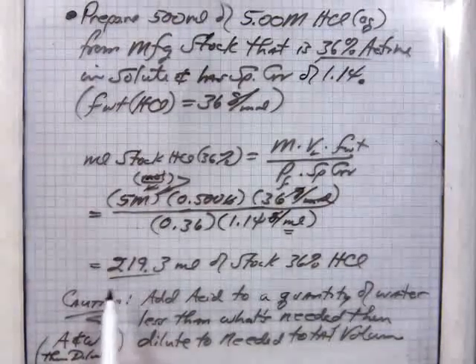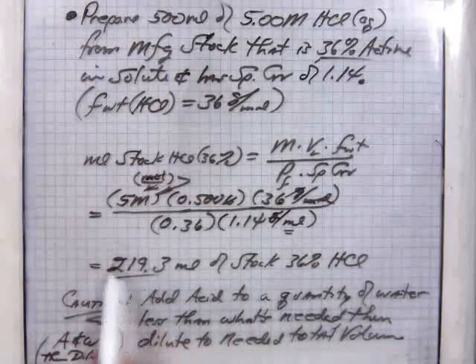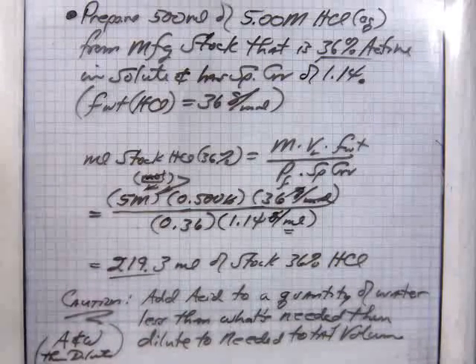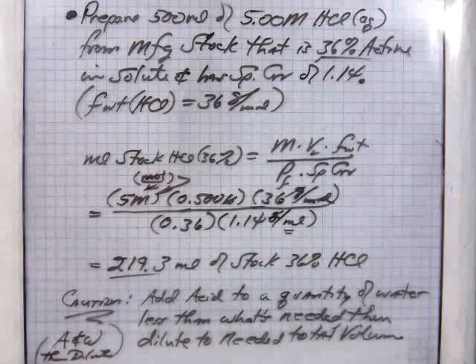Now, if you overshoot the amount when you make it, just go to the dilution equation and cut it back to what's needed. However, working with solutions affords many times more accuracy than working with solids.